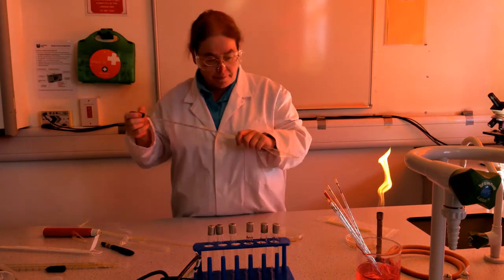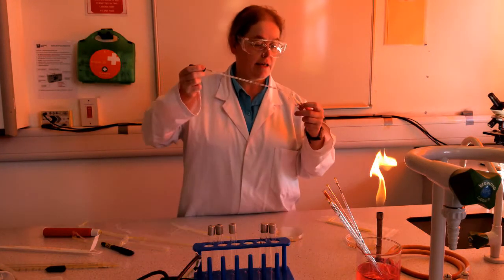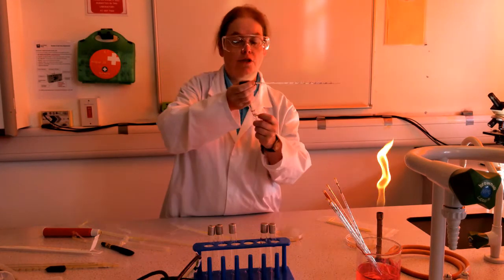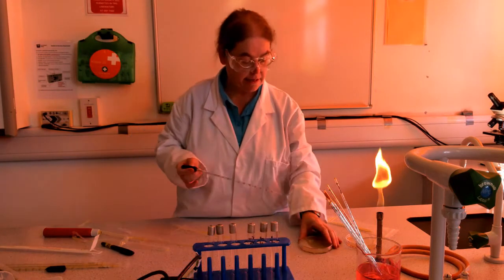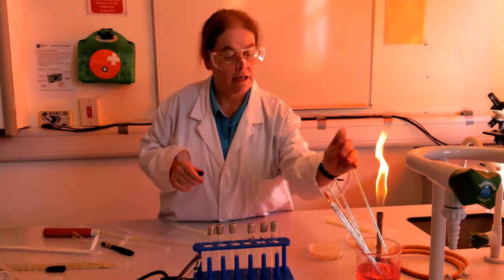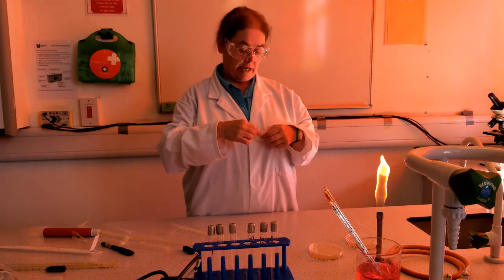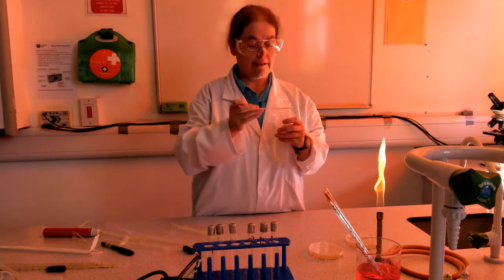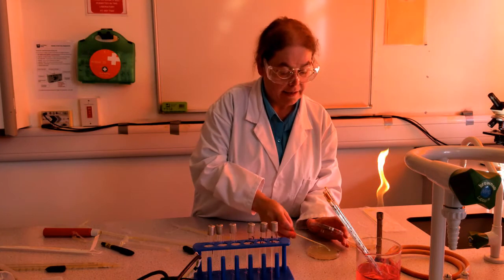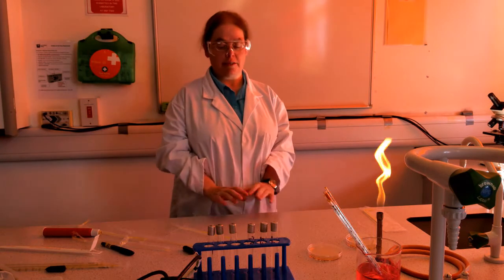Right, so I will now plate my 1,000,000 dilution onto the other plate. Again, 0.1 mils of my 1,000,000 dilution on here. Spread it with a sterile spreader. And you'll be pleased to know that's pretty much the end of the method. So I'll tape that in a moment. You've seen me putting tape on things before.